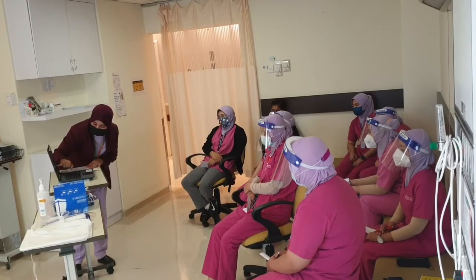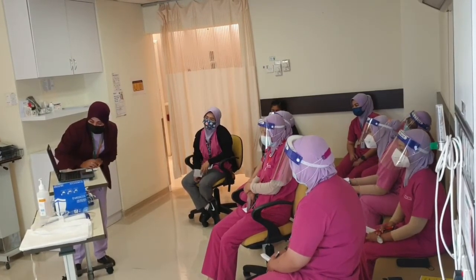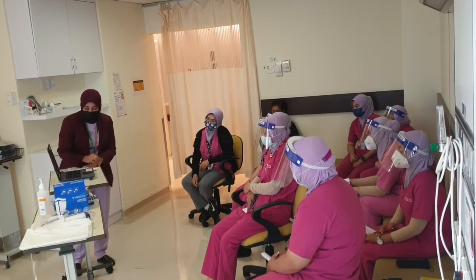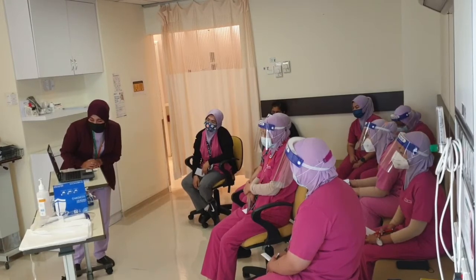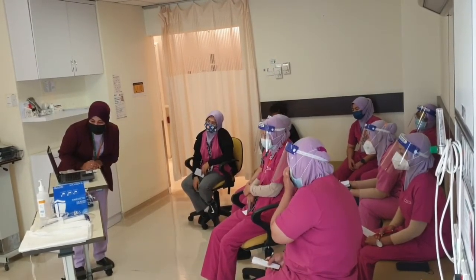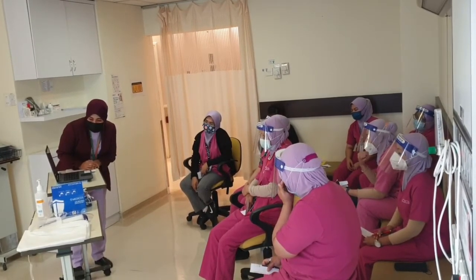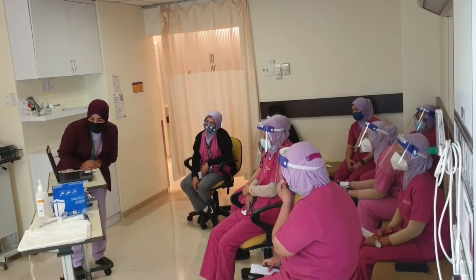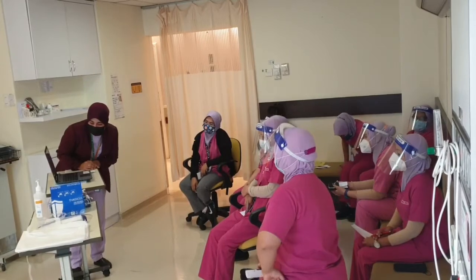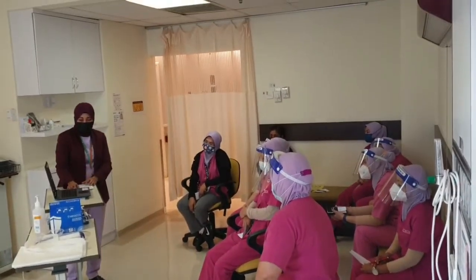Number 4, with your ungloved hand, slide your fingers under the wrist of the remaining glove. Do not touch the outer surface of the glove. Number 5, peel downward away from the wrist, turning the glove inside out. And the last one, continue to pull the glove down and over the inside-out glove, bringing both out together.